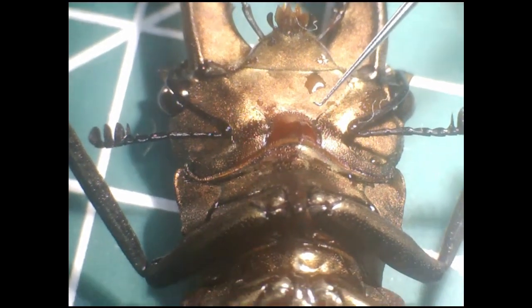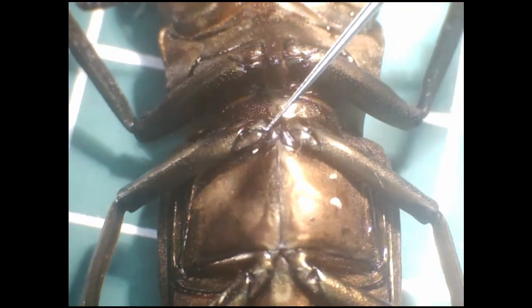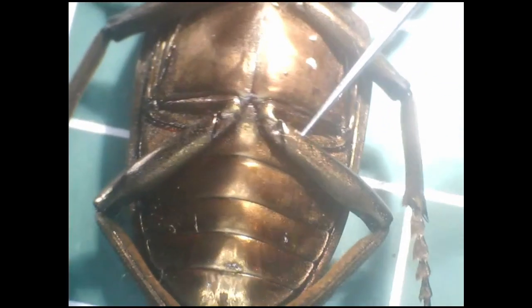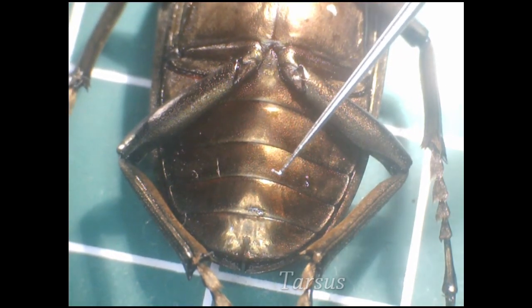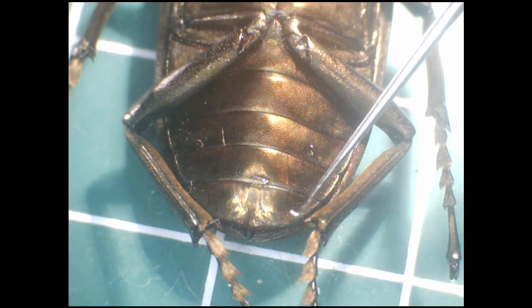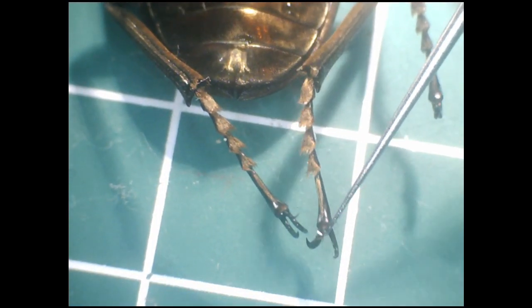Moving down, we have the sternum of the thorax, which has the first set of limbs. Then we have the sternum segments of the abdomen, where you can see the articulations of the other two sets of limbs. Here you can see the end piece of a limb called a tarsus. The other two segments of an insect's limb are of course the femur and tibia — yes, the anatomist basically just copied all of the terms from human anatomy. If we zoom in on the tarsus — the insect equivalent of the ankle — we can see the sensory hairs, and then at the end, the claw.